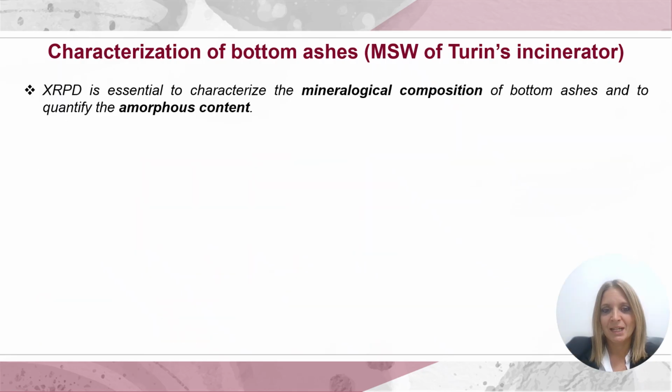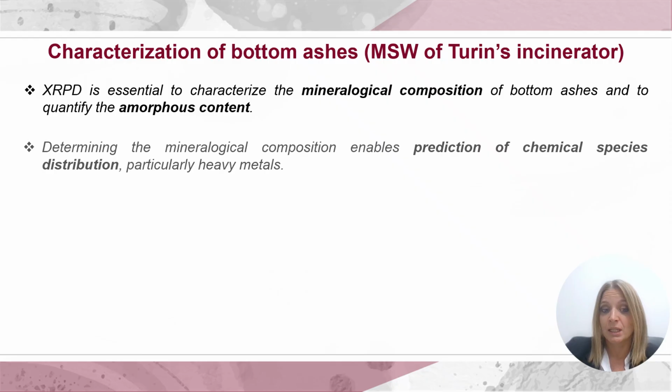To conclude, the characterization in terms of mineralogical composition of the bottom ashes and the quantification of the amorphous is really important, it's essential.